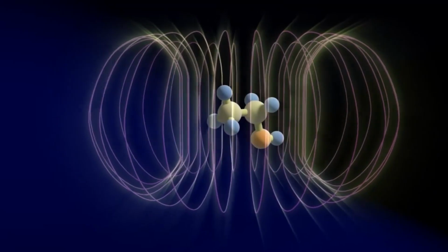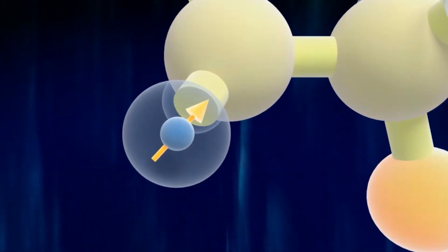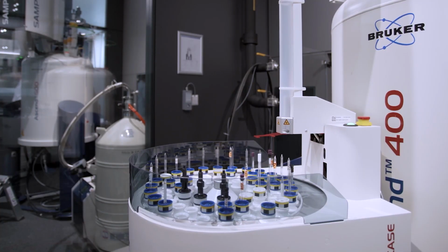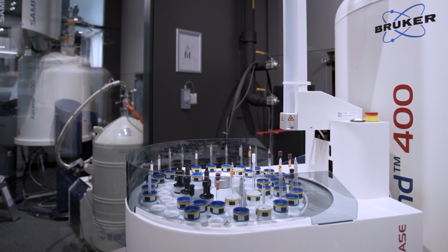There is hardly any other technique that is non-invasive, such as NMR itself, and gives you insights into structural information on crystalline as well as amorphous materials. And a lot of materials that are inside batteries are actually amorphous, which means if you apply other techniques like X-ray diffraction, you just do not get the information that you are able to source from NMR spectroscopy. And you are sensitive to any type of different chemical species inside the material.